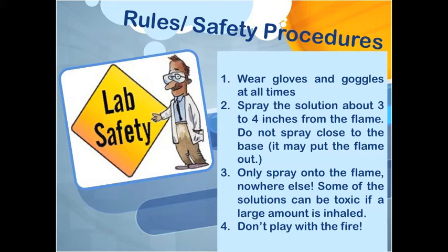The first thing we need to address for this lab is safety. It is very important that we remain safe for the duration of the lab time. Remember to wear splash goggles and gloves at all times. When testing the solution, spray the solution near the middle of the flame, not at the base of the Bunsen burner. In addition, only spray the solution into the flame. Some solutions are toxic.